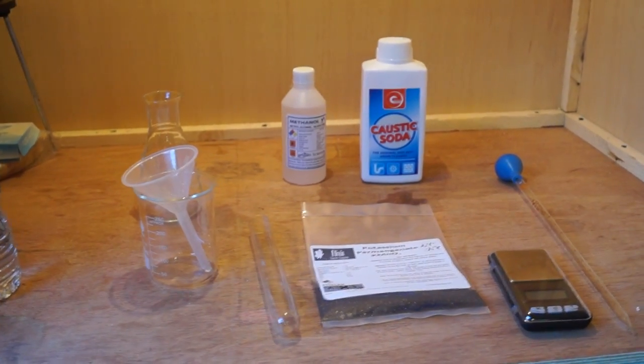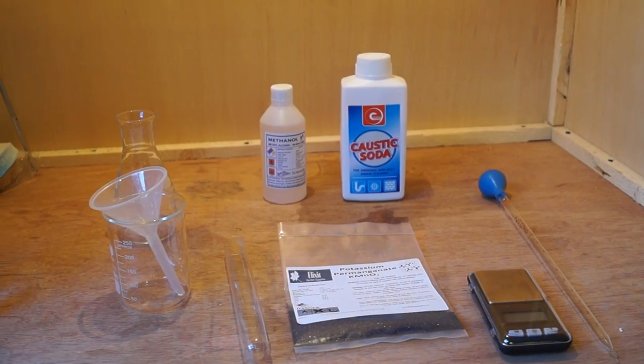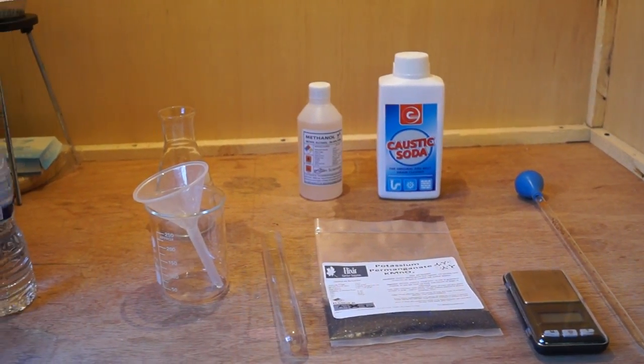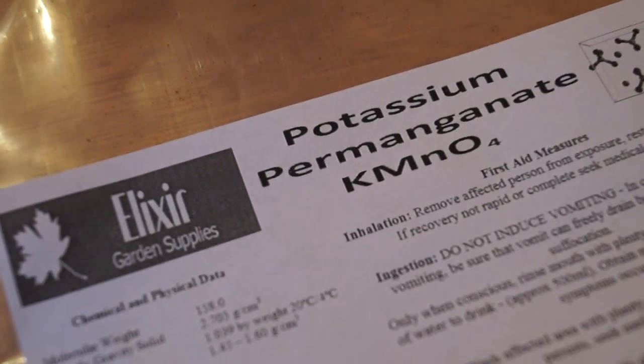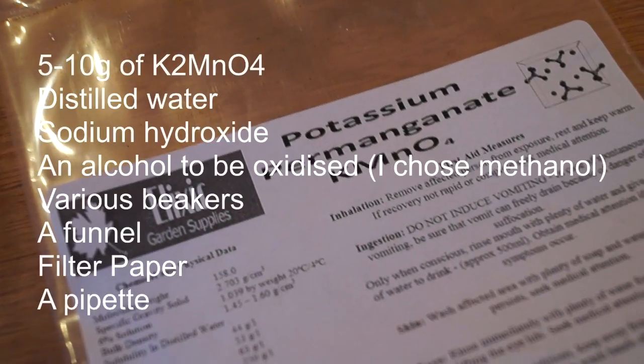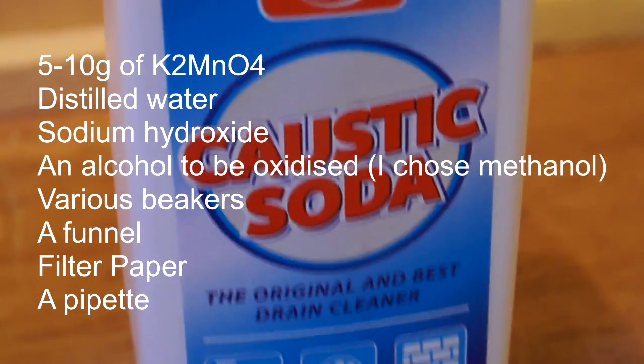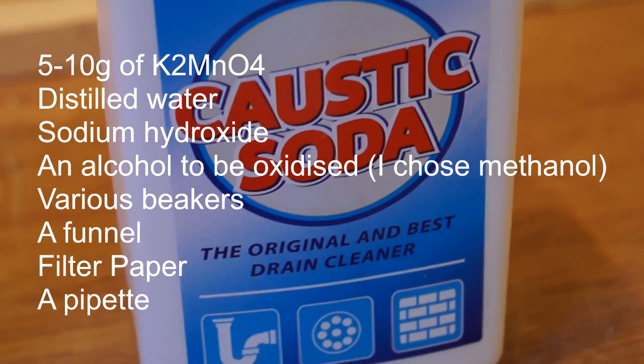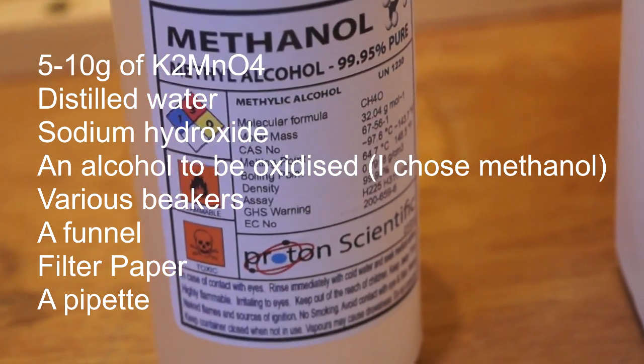Hello, in this video we are going to be looking at the oxidizing properties of potassium permanganate. You will need about 5-10 grams of potassium permanganate, distilled water, sodium hydroxide, and alcohol to be oxidized. I chose methanol.